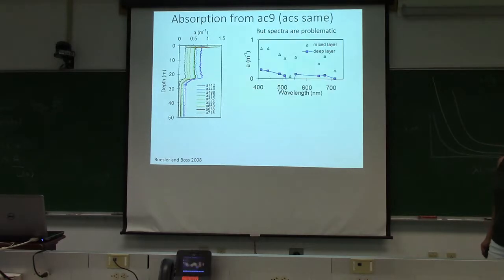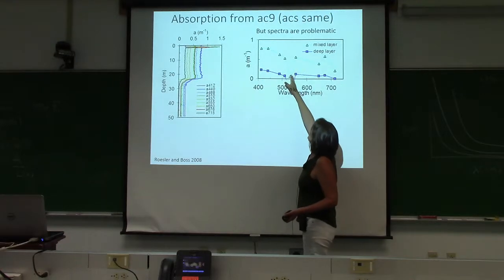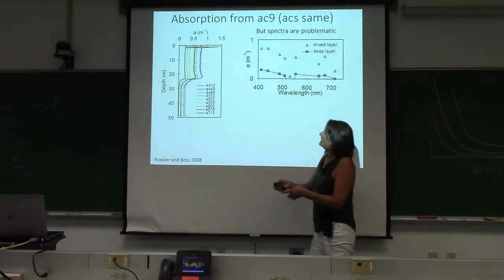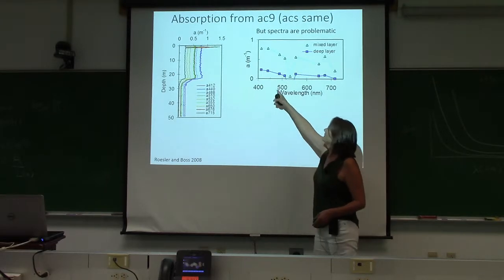And if you don't see the spectra of the data, be suspicious, right? A lot of people don't publish their spectra. So here is the spectrum from the mixed layer depth and from the deep layer. And yes, it's higher absorption here, lower absorption here. But look at the wavelength.